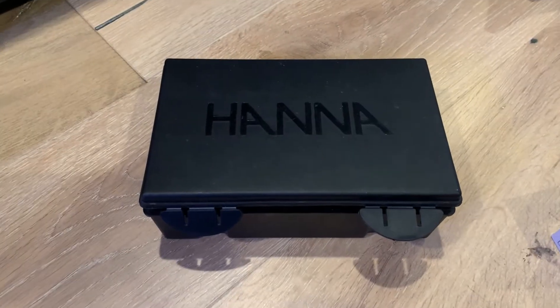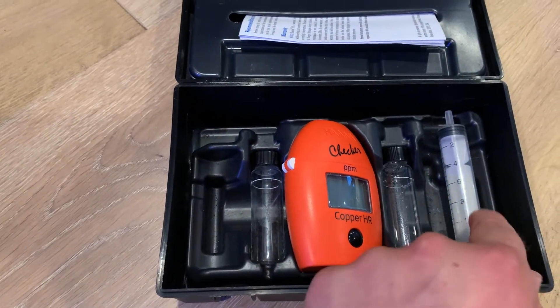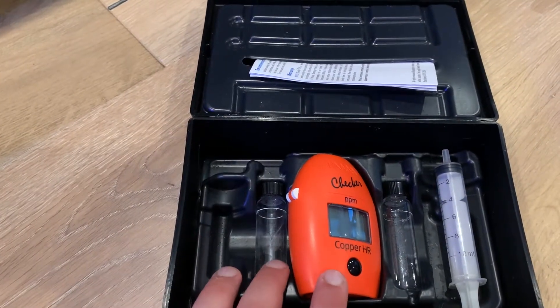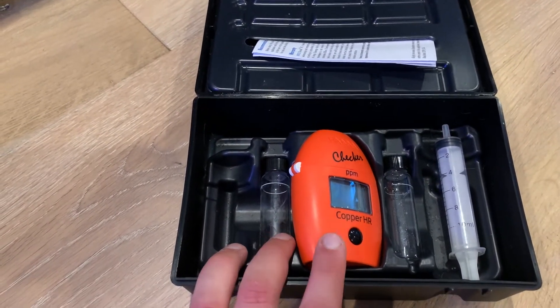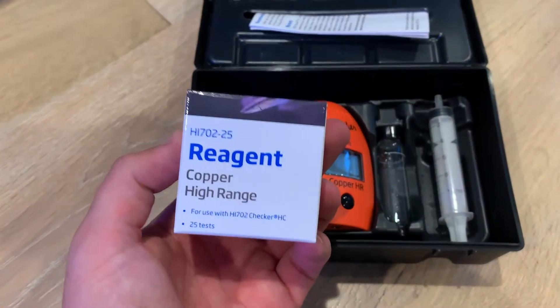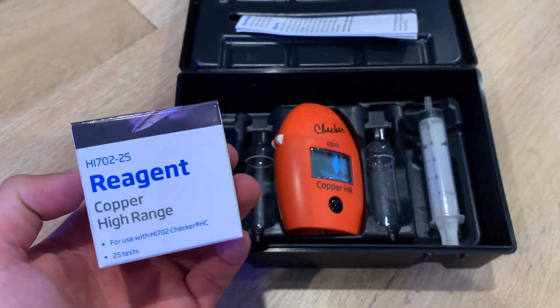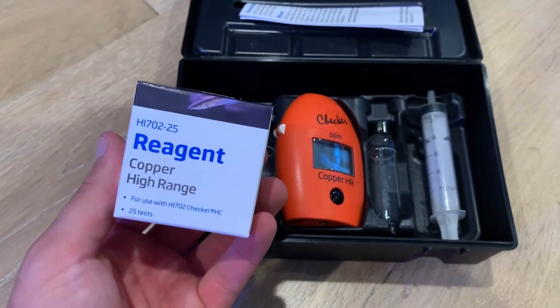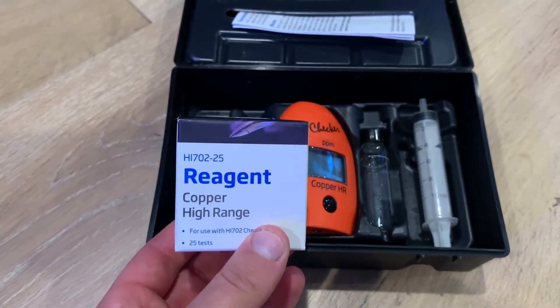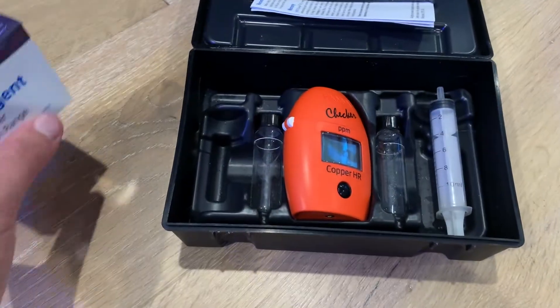When you get the box, there's really not a lot to it. You get the checker, two vials, and a syringe. Here are the instructions. You also have a few packets — I think you come with five or ten packets. That's really not a lot, so I highly recommend just getting a ton of these, especially if you're going to be vigilant with your quarantine systems, because you're going to go through these. I test every day. This has 25 tests, so this isn't even enough for one tank for an entire quarantine of 30 days. Just get them — they're not that expensive, but very important to have.